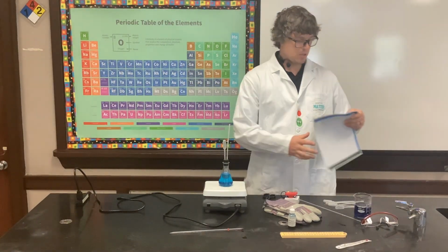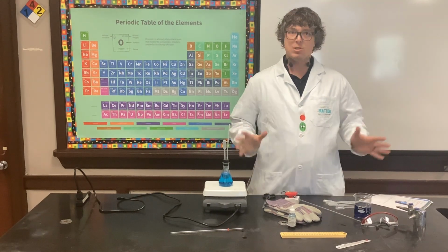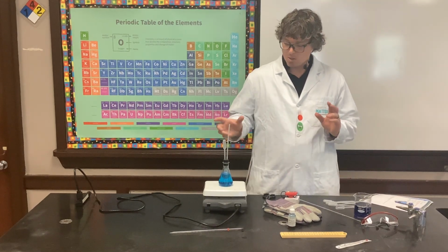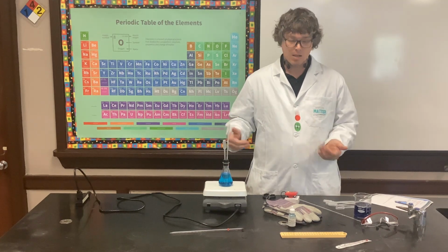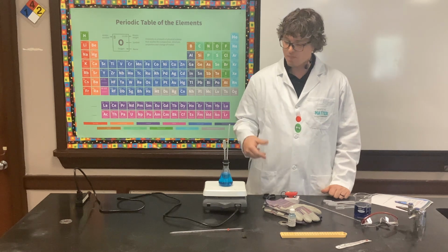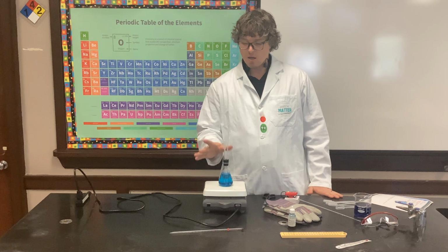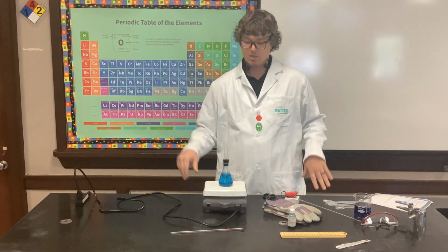Welcome back, teachers. Activity 9 in concept 1.1. Similar materials as last time because we were doing water, heating, and that sort of stuff. Setup for me didn't take too long because I already had most of this stuff out. You are going to have to put together this contraption, and multiple if you're going to have stations.